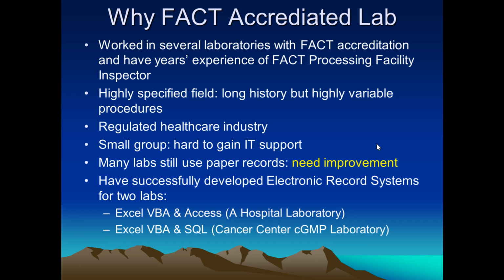Cellular therapy lab is a very specific field. It has a long history, started with bone marrow transplant, but is also very variable among laboratory procedures, so it's hard to standardize the procedures. This makes support from IT very hard to get.